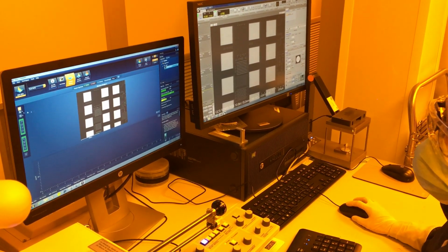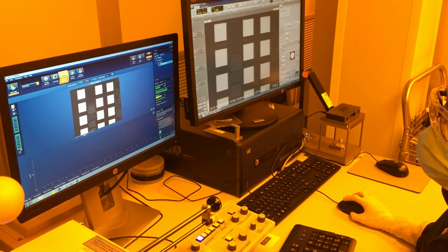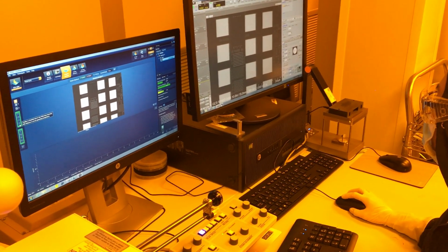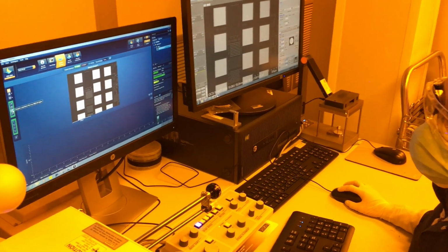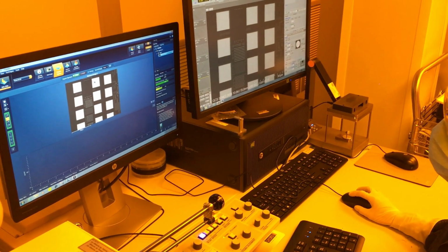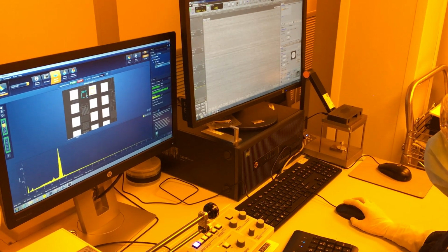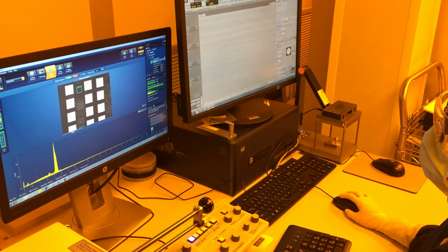And here on the left-hand toolbars, you have different shapes to select from. So I'm going to just select a square, and I'm going to compare this metal pad to maybe my field area. You can see it's going to label as spectrum 1 and 2. On here I can rename it.